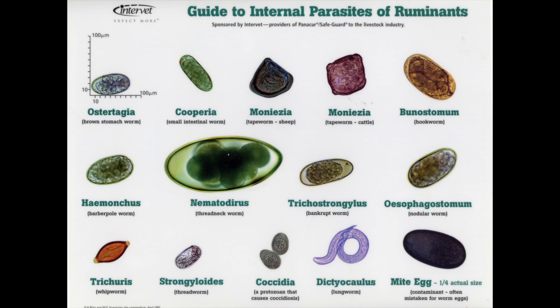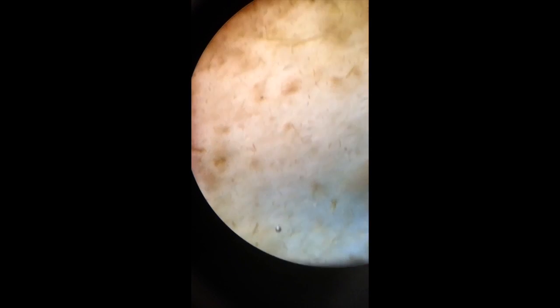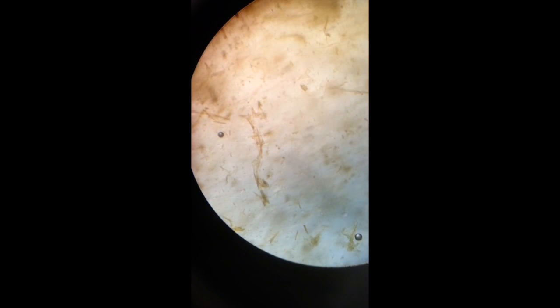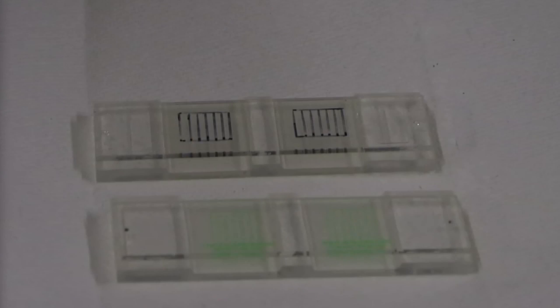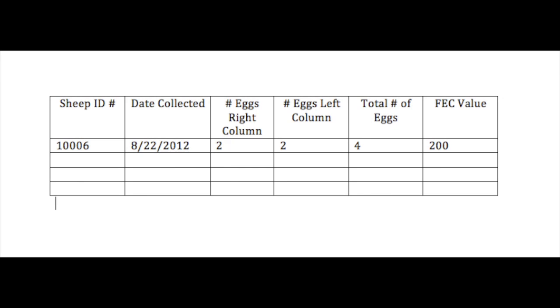Because treatments depend on the type of parasite infection, it is crucial that you understand the general classes. A parasite guide like the one shown can be very beneficial, and you can find many different sources of identification. We recommend training as the best method to master this counting technique. You will notice that the whole column will fit exactly in the view lens, so position your view to see the whole of one single column. When counting, only count the eggs within the bounds of the chamber and those on the lines. McMaster slides with darkly colored lines can be purchased if it is hard to view the column lines. Anything outside the lines is disregarded. Keep a pen and notepad handy, record the number of eggs in each column for each chamber, and then repeat the counting procedure on the second chamber.